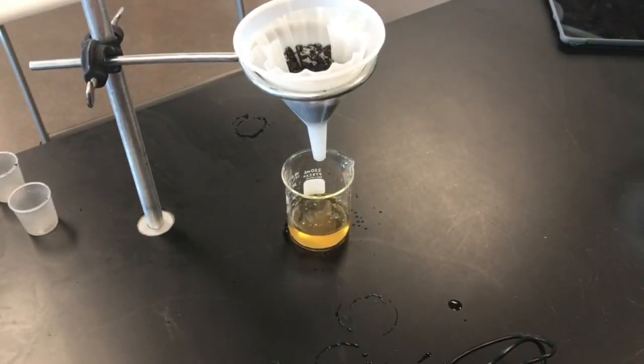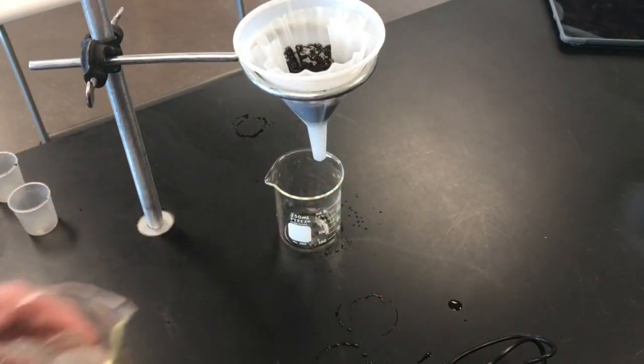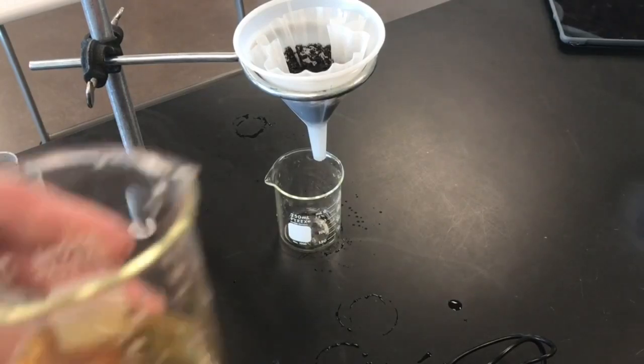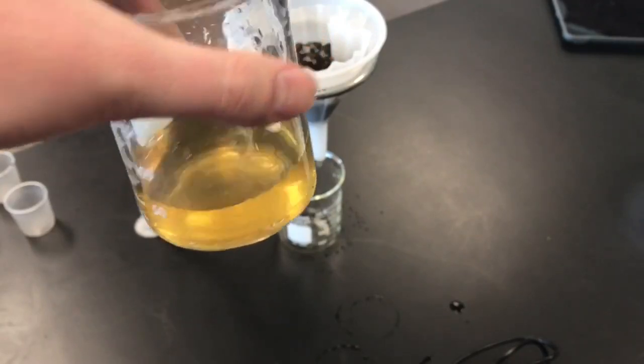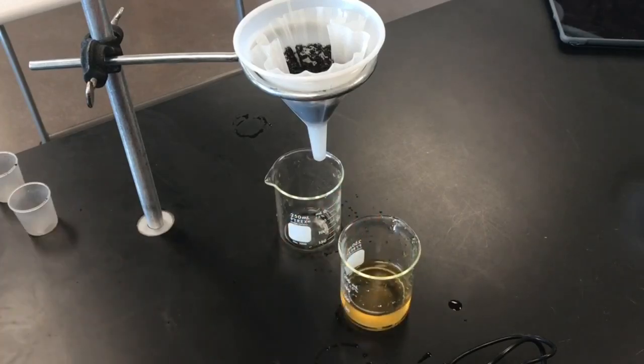So it looks like my 3rd run is finishing up here. You're not obviously going to wait till every little droplet is out, so I'm just going to make sure I have something under here. This is what our solution should look like after a 3rd run through. Nice, beautiful color right here. So this is our sulfuric acid, ran through soil A 3 times. Set that down here, and we're going to take a final measurement.